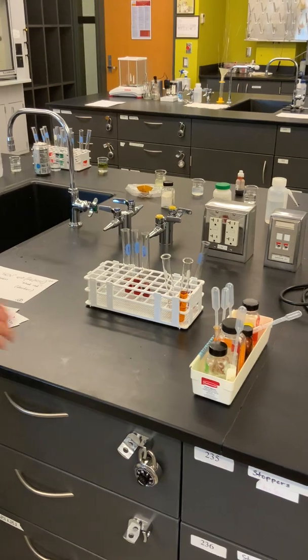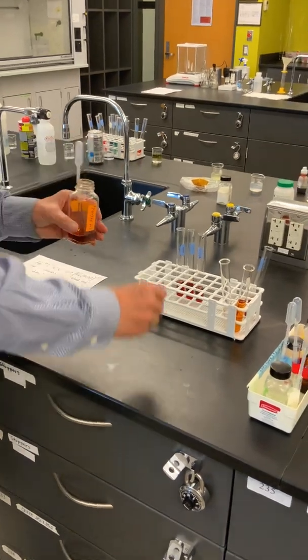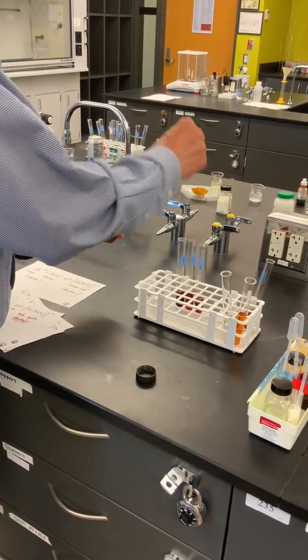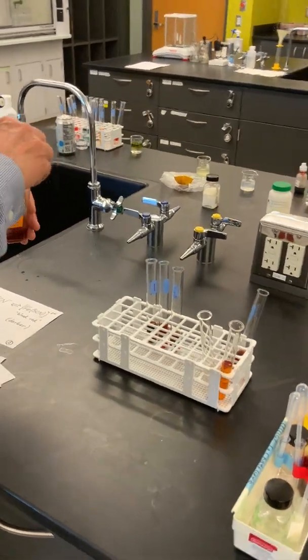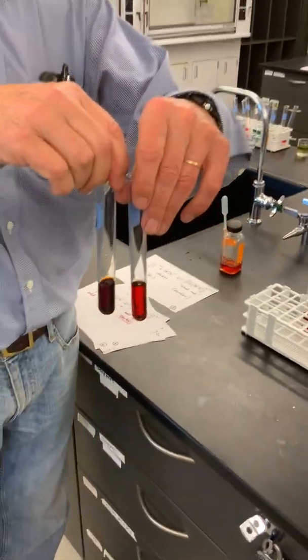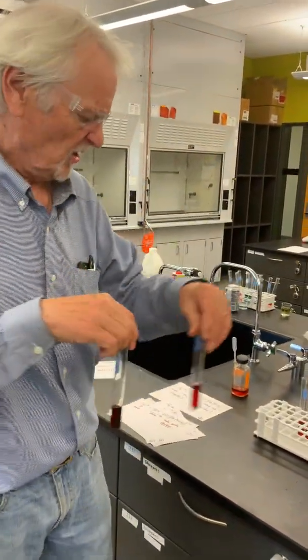And what we're going to do is add some iron 3 ion to our equilibrium. Here we go. Just going to take and add a little bit to one of these 3 test tubes. And the question is, does the solution get lighter or darker or stay the same? Well, here is the one I added the iron to. Here is our original solution. What do you think? Hopefully you can all see that the solution got darker.